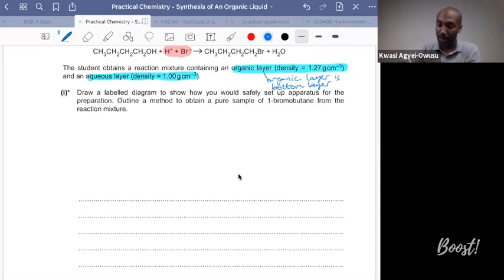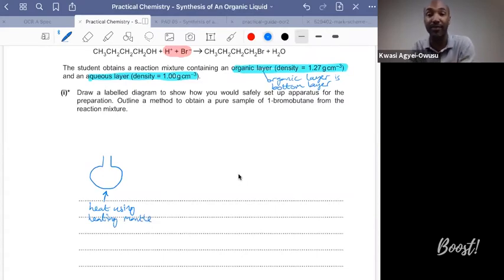So we're going to be refluxing. We've just looked at a diagram of the reflux. We're going to be heating using an electric mantle, a heating mantle, so that you don't have any naked flames. You don't want to ignite any flammable liquids present. So your butanol is likely to be flammable. So here's your reaction mixture in a round bottom flask, and then you've got your condenser.